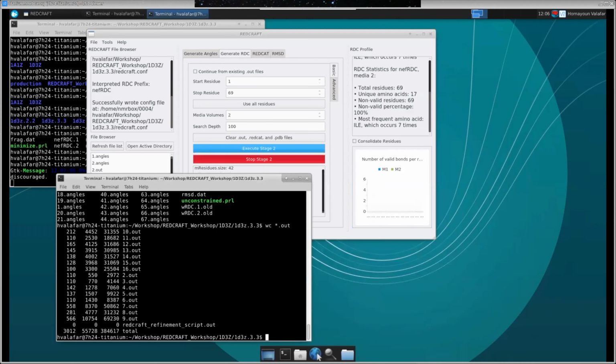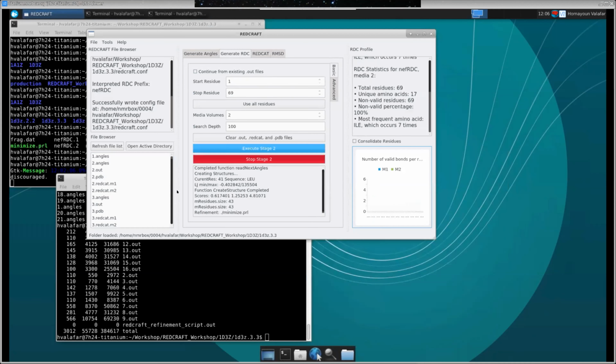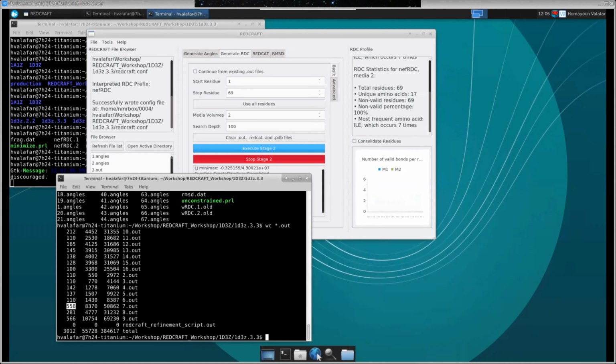You can— hold on, one sec. So when you showed in that advanced tab, you said 500 clusters in the decimation tab. Can you go there? So yeah, that is correct. So 500 clusters, not 500 structures, right? Yeah. Let me break it down. So 100 structures, my depth search is 100 structures. So 100 unique structures, specific structures are permitted to go to the next round. That's right. 100 of the 558.